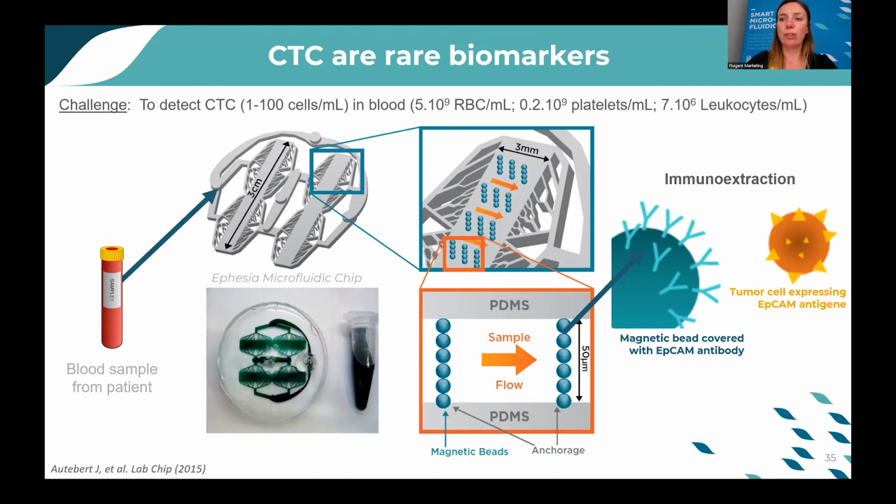And so once the CTCs have been trapped, they can either be labeled or analyzed by DNA hybridization directly within the chip, or the cells can even be retrieved for further analysis. So this is a multi-step protocol that is based on sequential fluid injection and that has been automated with ARIA. If you want to know more about this chip and this approach, I suggest you read their paper.